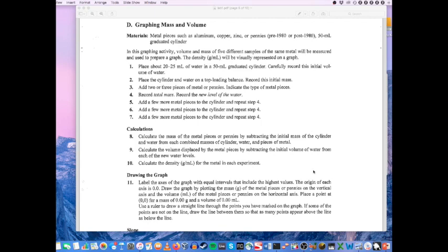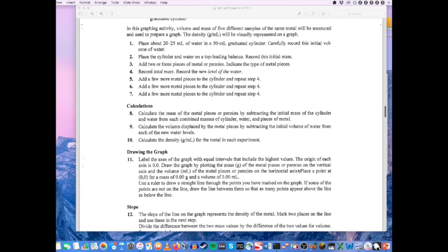and add a small number of coins again, and then measure the volume displacement and the mass again, and you repeat this a few times to get several data points, which you will then graph on Google Sheets, which I will demonstrate, and then you will submit this as part of your report as well. So the slope of the line formed by the graph of these data points has units of grams per milliliter and is equal to the density.